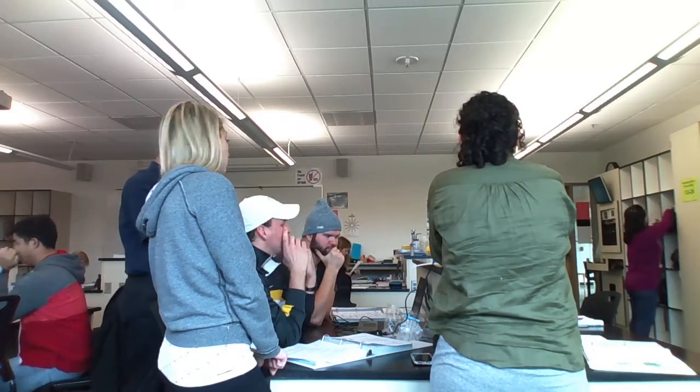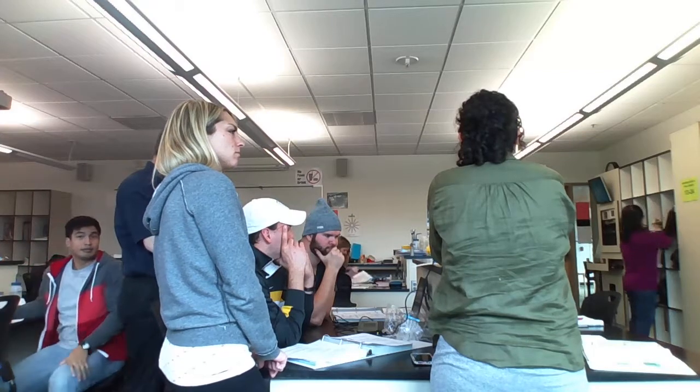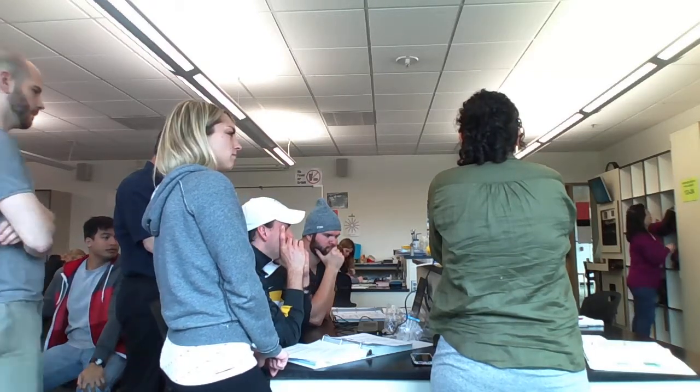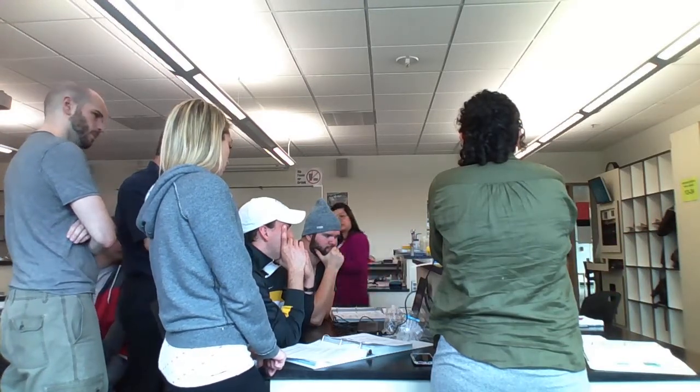Like a little puff, like you're gonna sneeze or something. There it goes. Okay. You just don't breathe enough. I gotta just be able to hear this. We'll do a sample and just see what the math is.